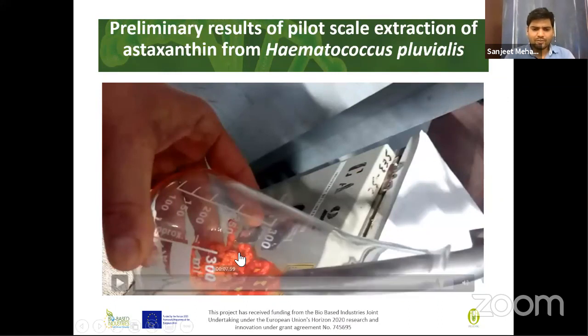We collect the extract in solid form, because in the extraction phase the CO2 works in the liquid phase, while in the collection of the extract, we collect it in solid phase. After a few seconds the CO2 disappears and we collect the extract in powder form or semi-solid, due to the presence of oils or fatty acids in the extract.